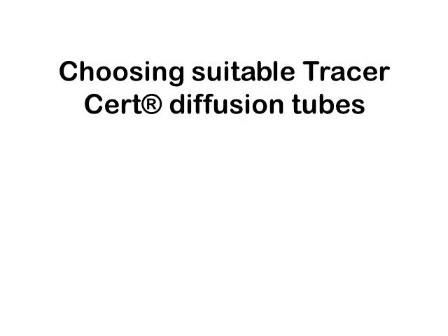What do we need to know or to be able to estimate to help us to choose suitable tubes for our requirements? The smaller the bore and the greater the length of the precision bore part of the diffusion tube, the smaller is the rate of diffusion of vapour out of the tube. Vapour concentrations can be generated over a wide range, from below ppb to very high ppm.